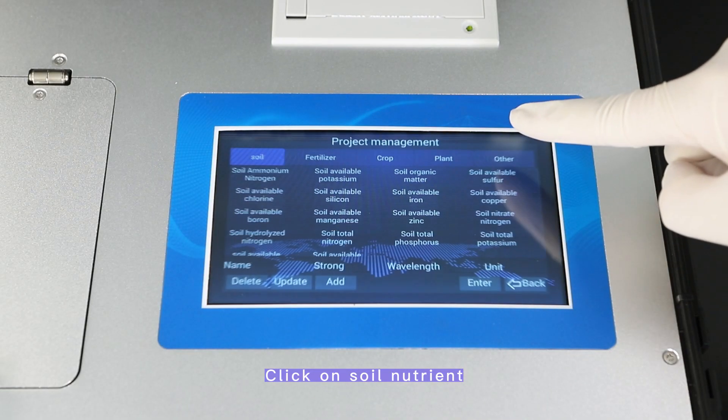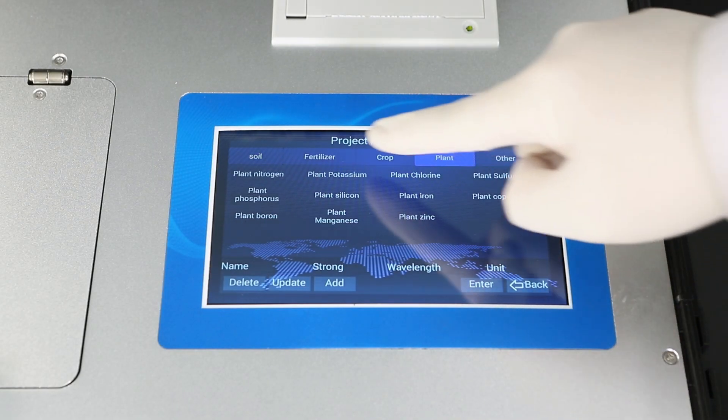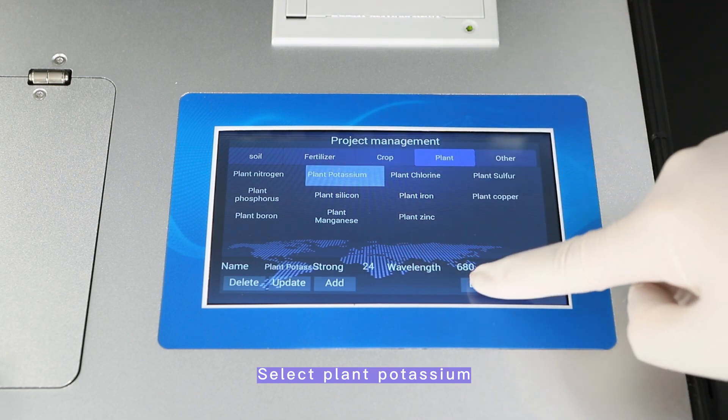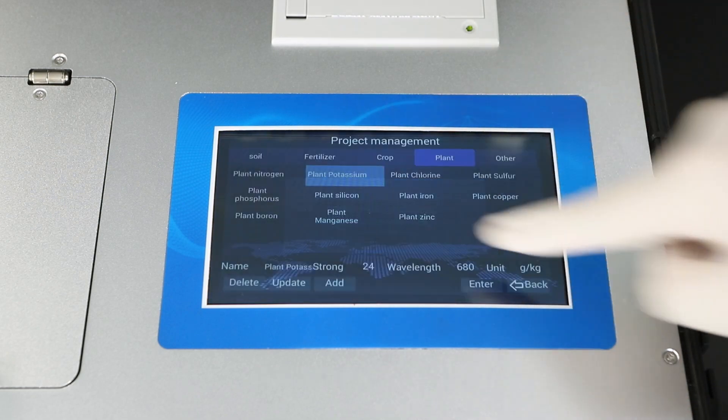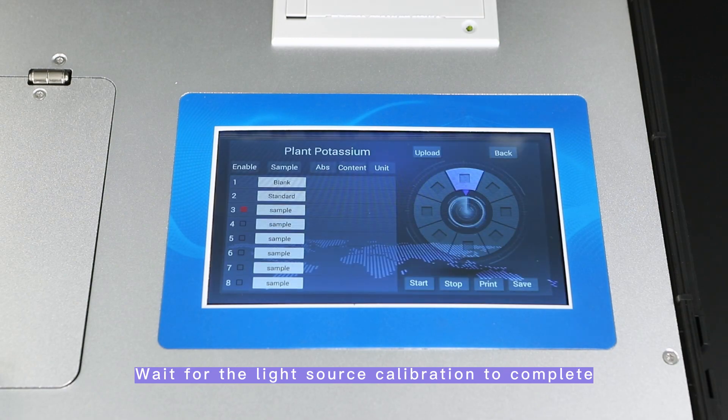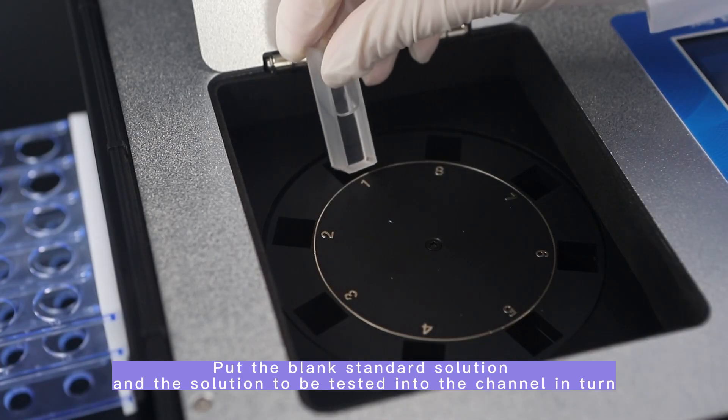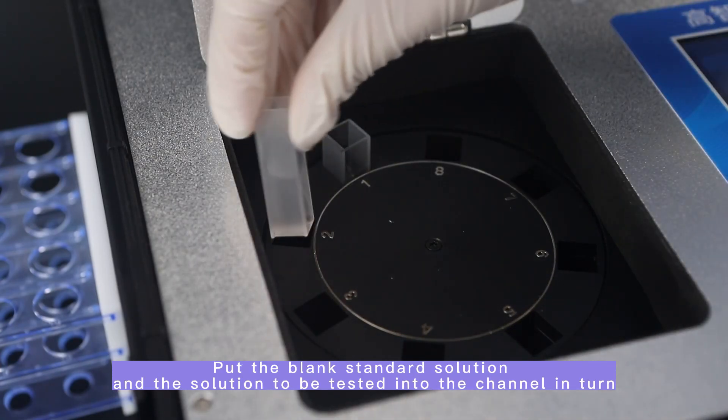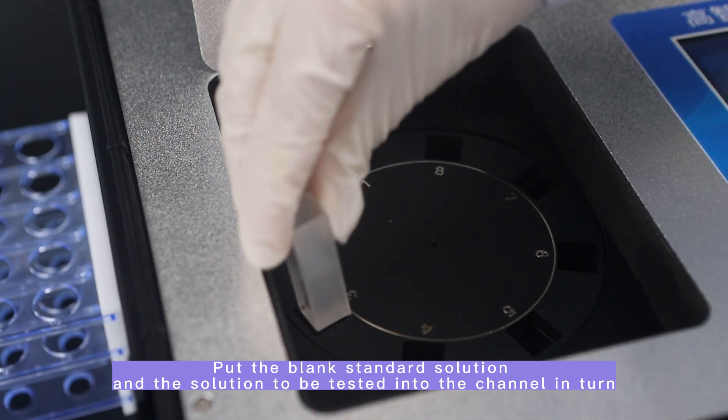Click on soil nutrient. Select plant potassium. Wait for the light source calibration to complete. Put the blank standard solution and the solution to be tested into the channel in turn.